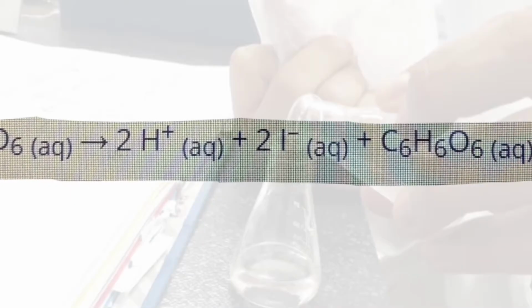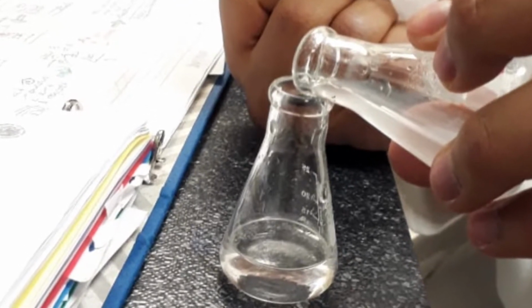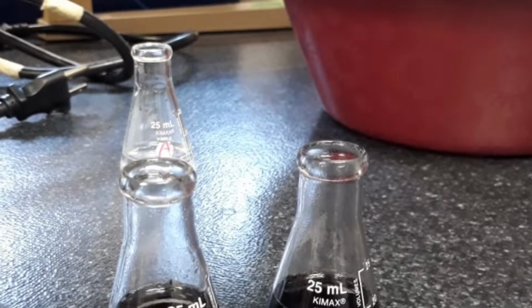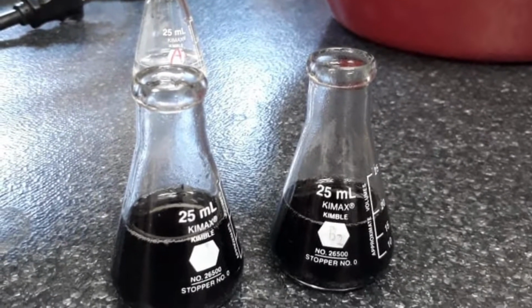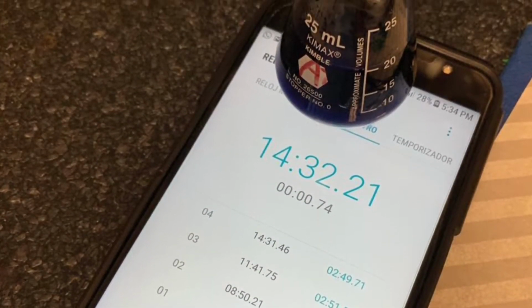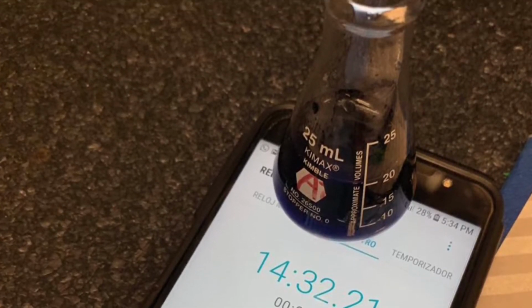By adding the hydrogen peroxide to the mixture of vitamin C and iodine tincture, reaction 1 is initiated. Reaction 2 consumes the molecular iodine formed in reaction 1 as soon as it is produced, so that the concentration of I2 remains very low over time. When all vitamin C has been consumed in reaction 2, the concentration of I2 increases considerably in the solution and an iodine compound is formed with starch, which is dark blue and marks the end of the chemical reaction.